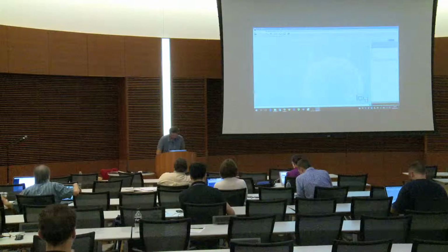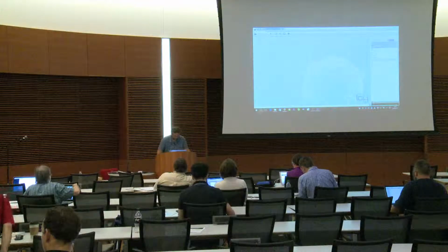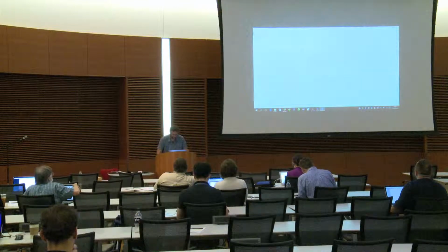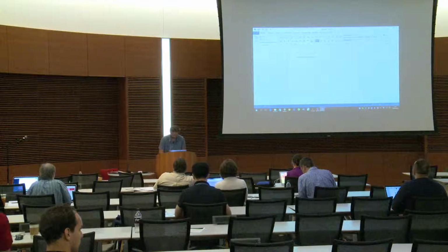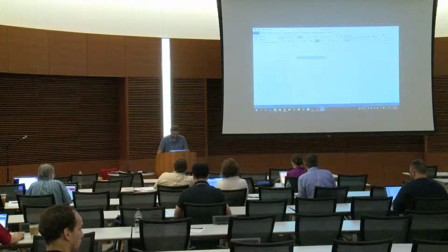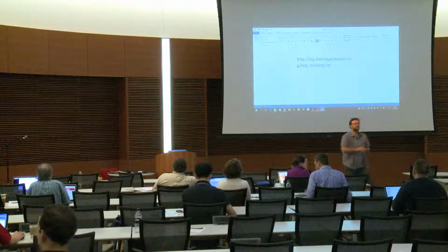Okay, for the images, you just take this and you will have the images, but we will just need a few, let's say 3 or 4.